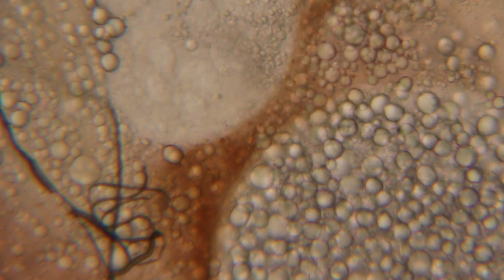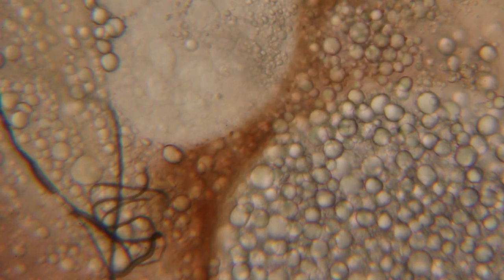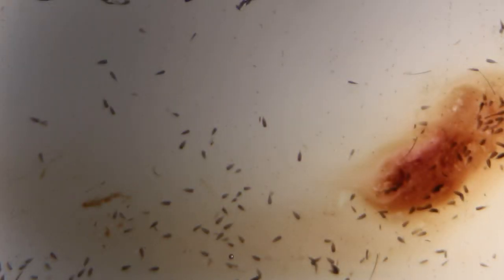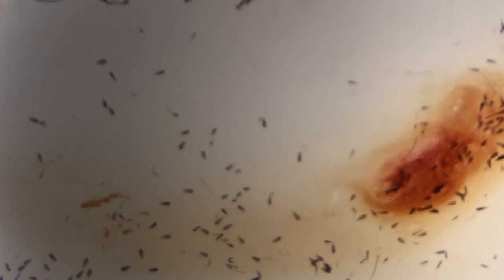And you can see there is a major difference between this and my normal blood. These are my blood cells here. It looks like the hemoglobin has essentially leached out of the blood cells. And here you can see this is the actual abdomen of the mosquito. There are these little pieces in here, and I'm wondering if these are eggs. I'm not positive, but I can't think what else this could be inside the mosquito's abdomen.